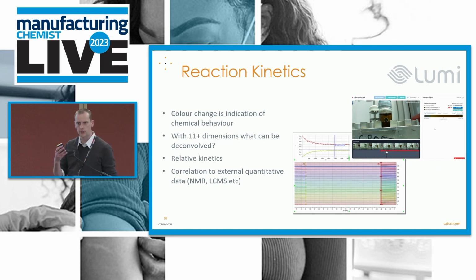So reaction kinetics. Color is an indication of chemical behavior, and so we can start to derive at least relative chemical kinetic plots from these sorts of color changes. With a multidimensional data set, like we've got those 11 different dimensions, what other information can we start to pull out from this visual information that will allow us to draw some chemical conclusions? It's relatively easy to correlate this data to isolated LC data points or other spectroscopy data points, and so you end up with a quantitative description of what's happened in the reaction, linking those two things together.